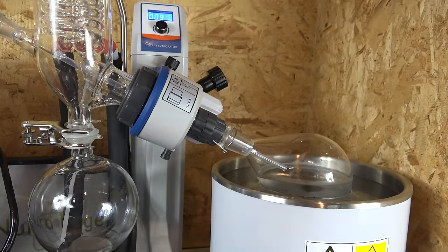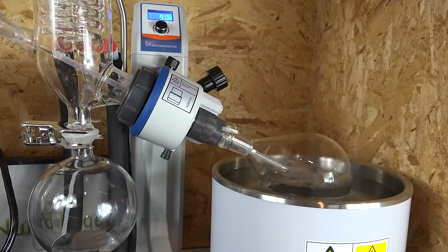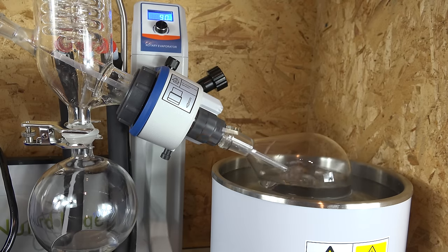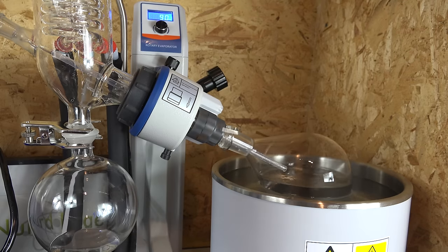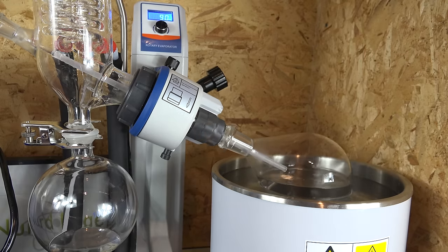Alternatively, if we're working with air-sensitive compounds we can feed inert gas through here to purge air from the flask as we operate. Another use is to blow air or gas in while the solvent is being removed to help with very badly behaved or unruly solvents. Solvents can sometimes violently boil and shoot into the condenser, losing product — we call this bumping. To prevent bumping, weaker heating can be used, as well as deliberately opening the gas inlet valve partially to reduce the vacuum. But by feeding incoming gas into the flask, it can be used to blow onto the solvent and dry directly — just like blowing on something wet. So by carefully opening the gas valve we can drive off badly behaved solvents that would bump under harder vacuum, while still maintaining a high evaporation rate. In some labs I've worked in this tube went missing or was broken, making rotovaping much longer and more delicate due to bumping problems.